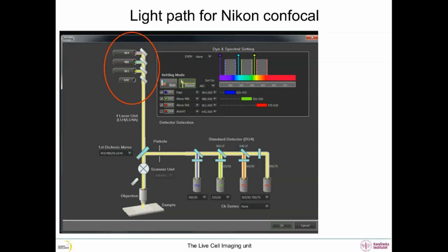As seen before, we will excite DAPI with the near UV 405 laser. We will excite FITC with the blue 488 laser. We will excite TRITC with the green 561 laser.